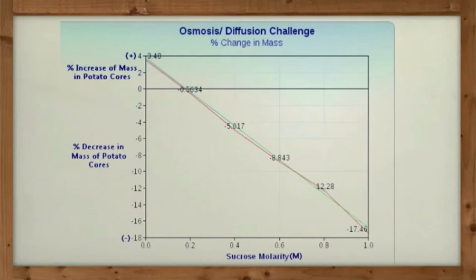Using the percent change of mass as the y-axis and the molarity of the solution as the x-axis, we can graph the values of the green solution and the blue solution. By connecting these 2 points, we form a line. By plotting the percent change values of the remaining solutions, we find that they are relatively close to the line connecting the percent change values of the green and blue solution. Thus, we can surmise that the other molarities have a common difference as well.